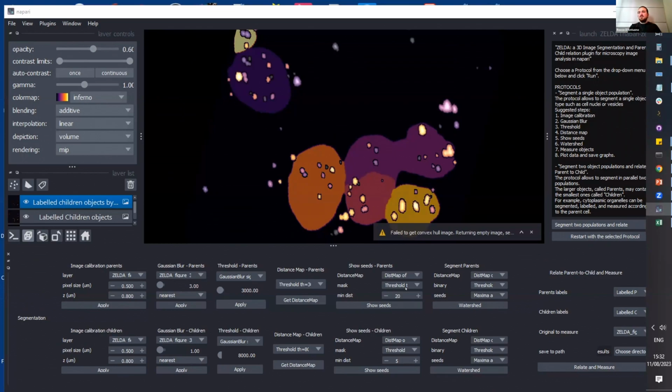You have to use a small trick. You have to use some filter. It might be a variance filter or other filters that unfortunately are not implemented here in the plugin. But having done this step of processing, later on you might hope to apply a threshold and get this bright field image as the one that contains the parent object.